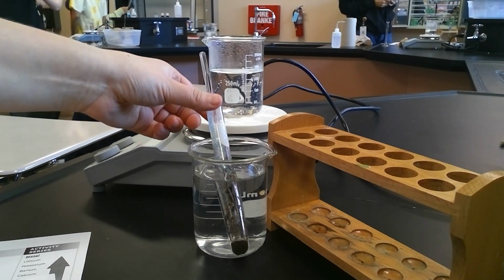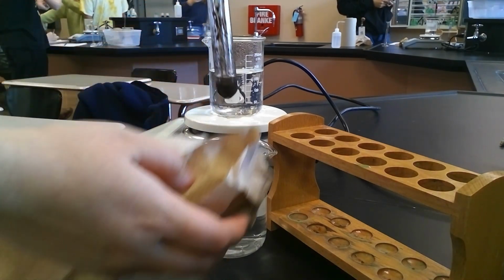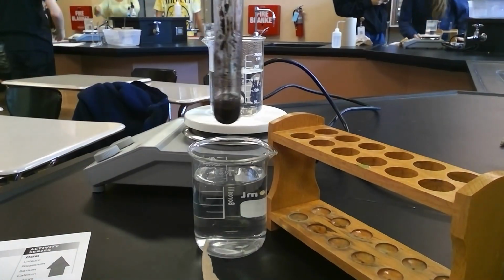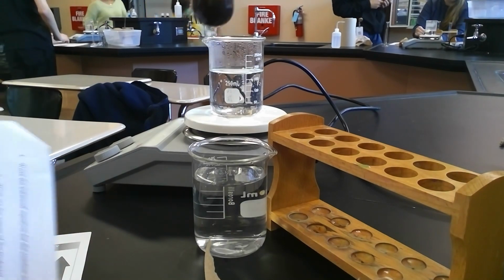So one of the observations that a lot of students are missing because they're going too quickly at this step: I just dry off the bottom because there's some water on here. If we're super careful with this, and then hold it up against a dark background, I'm not sure how well that will translate. Let's see. You can actually see the separation of the layers in this, and so it looks like murky water. Let me get on the camera and see. Okay, yeah, you can see through part of it.